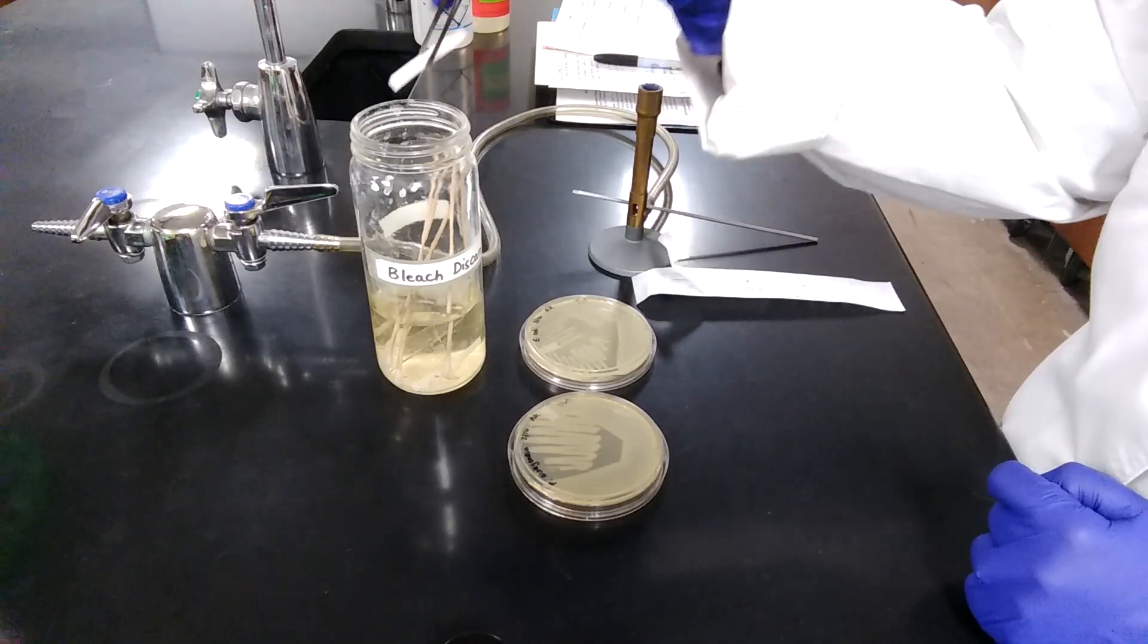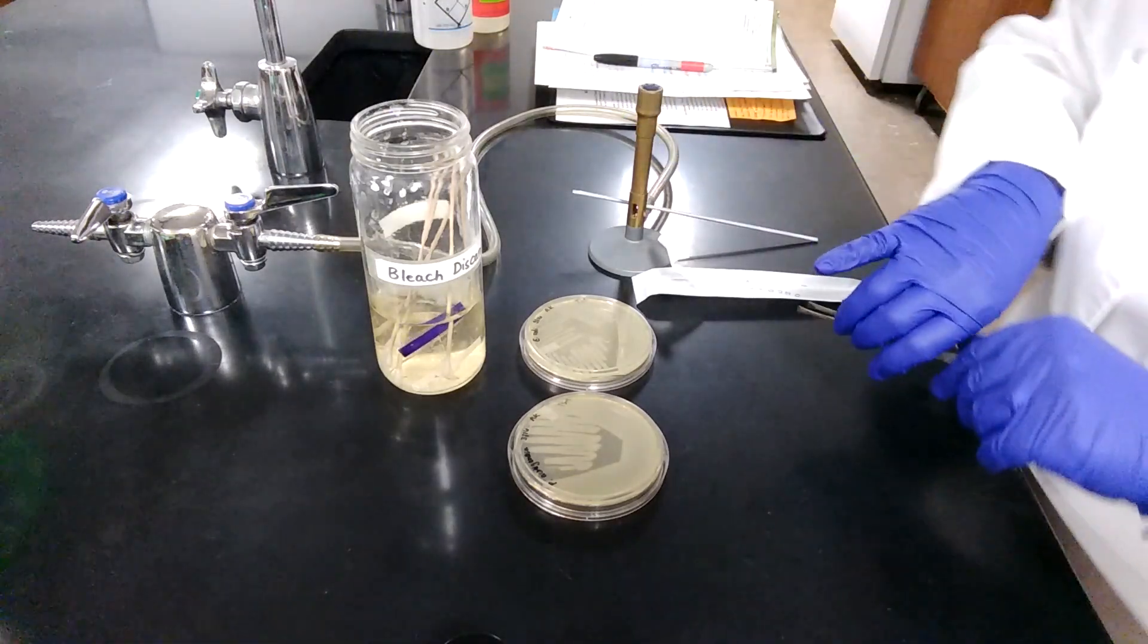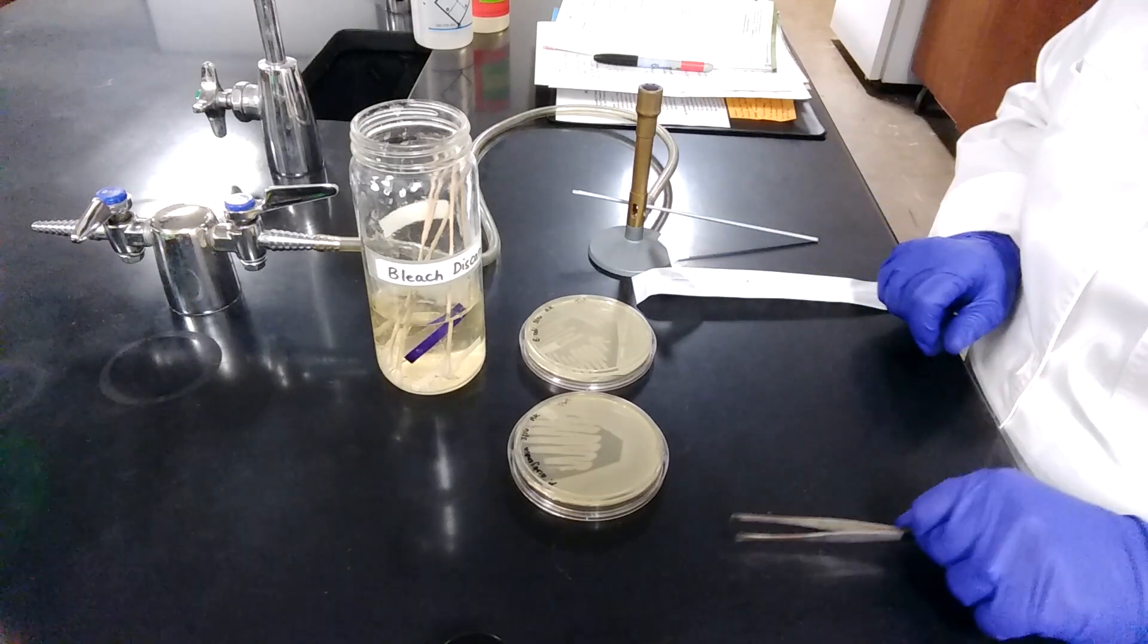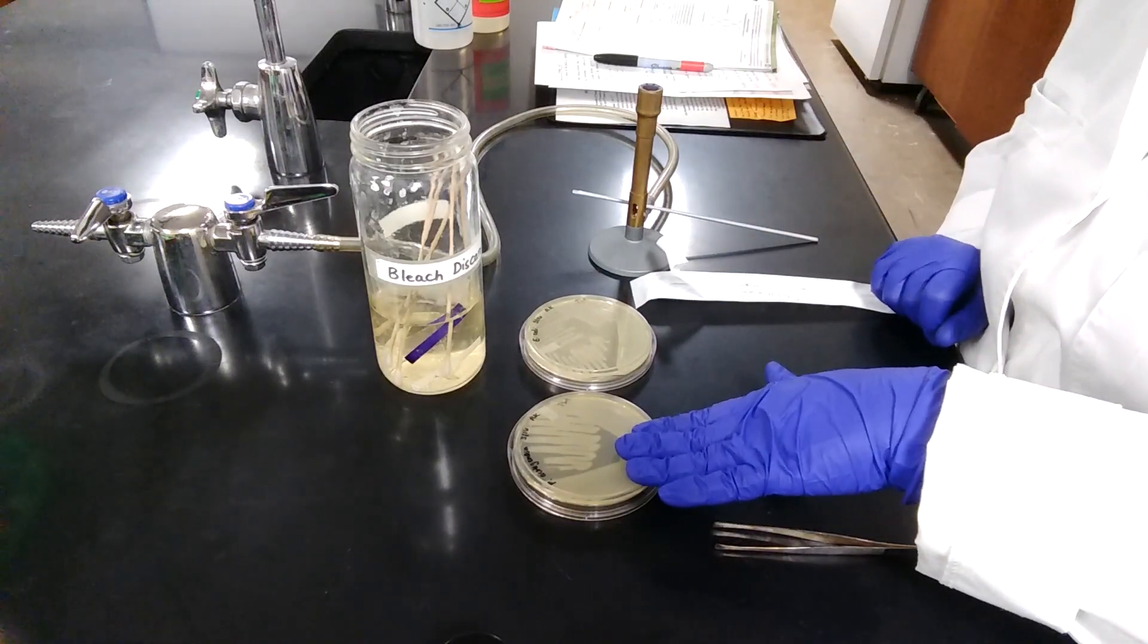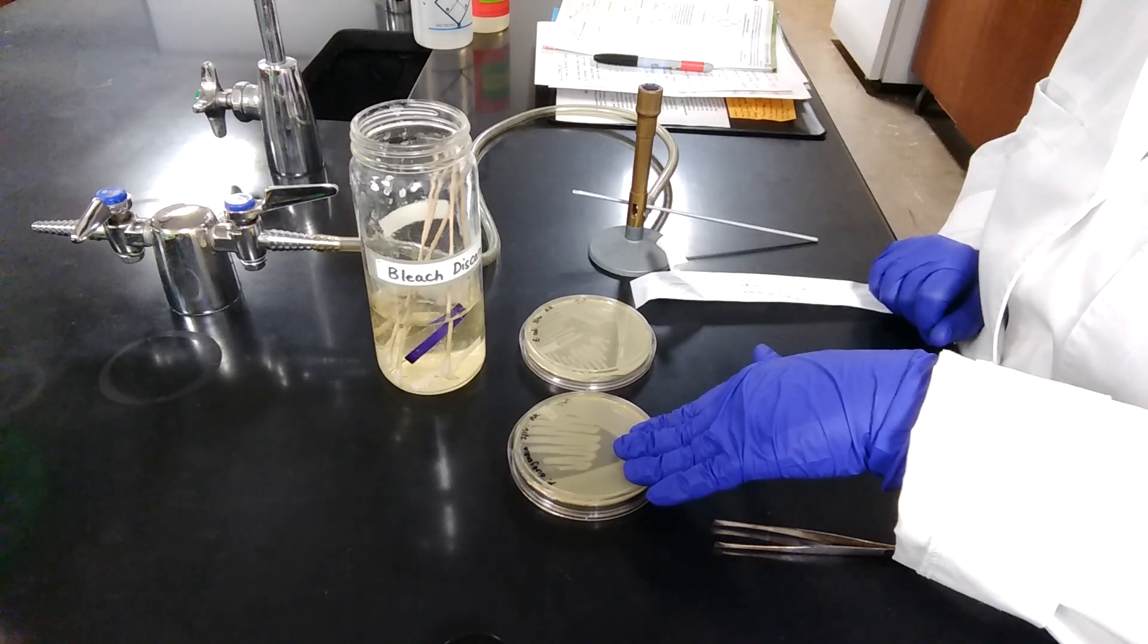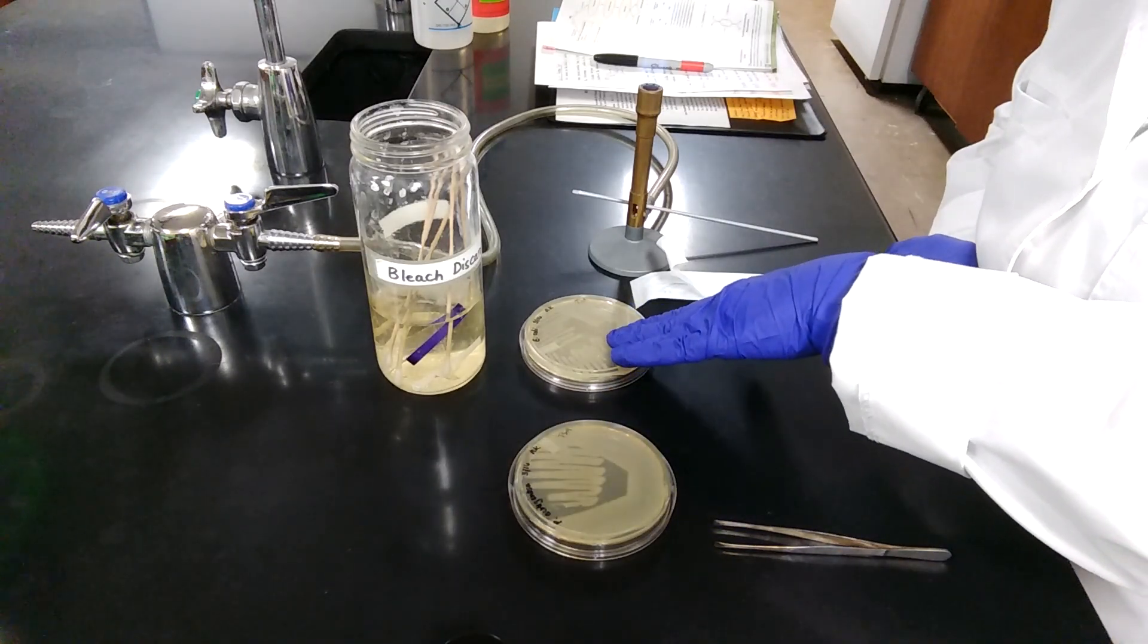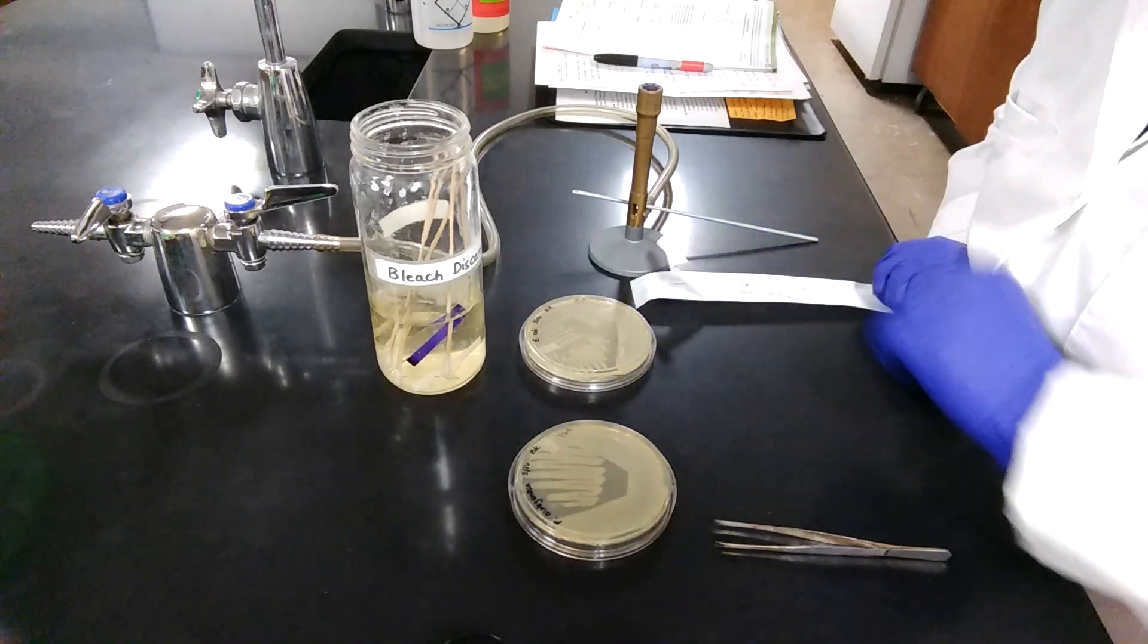Dispose of the used paper strip into the bleach discard and disinfect your work area. So the results suggest that Pseudomonas aeruginosa are positive for cytochrome C oxidase production, whereas E. coli are negative for cytochrome C oxidase production.